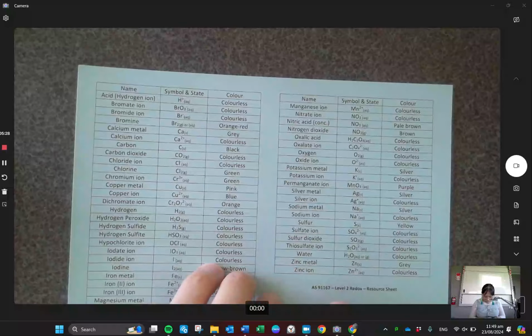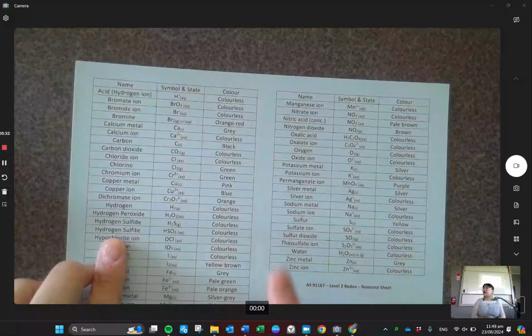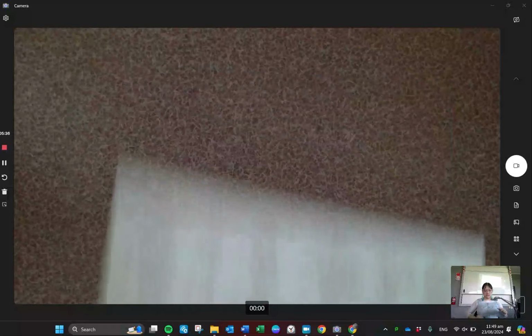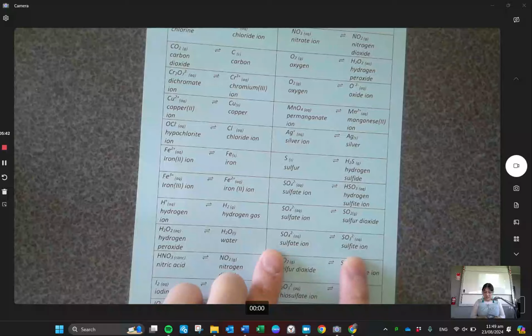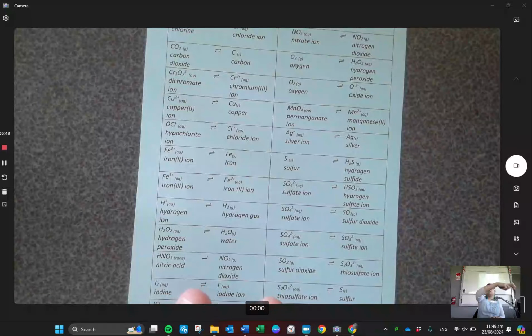There. Colorless. So again, we wouldn't have expected the blue color to change if that was the case. So you can go through and troubleshoot it. You can work your way through and see all the places that you see sulfate. And everywhere you see sulfate, the ion that's forming is also colorless or it's forming bubbles, and we haven't seen anything in our observations that suggests that has happened. Are we good with that so far? So that again confirms we are dealing with copper.